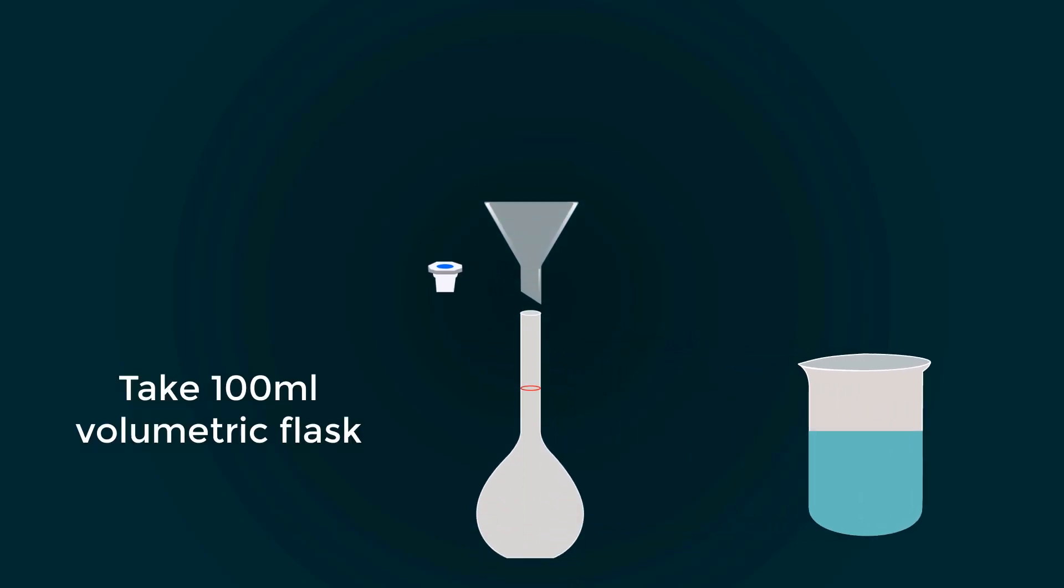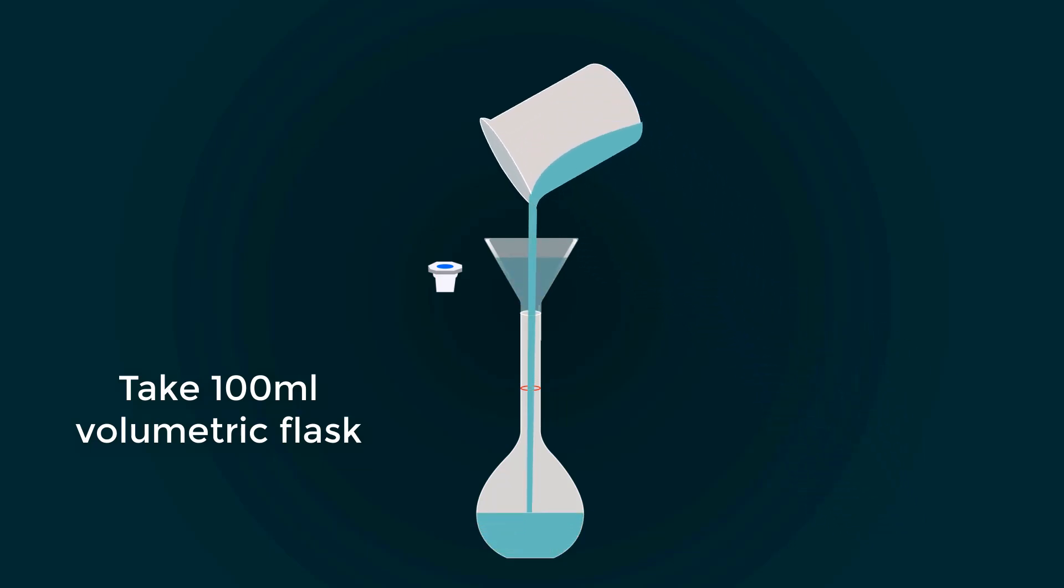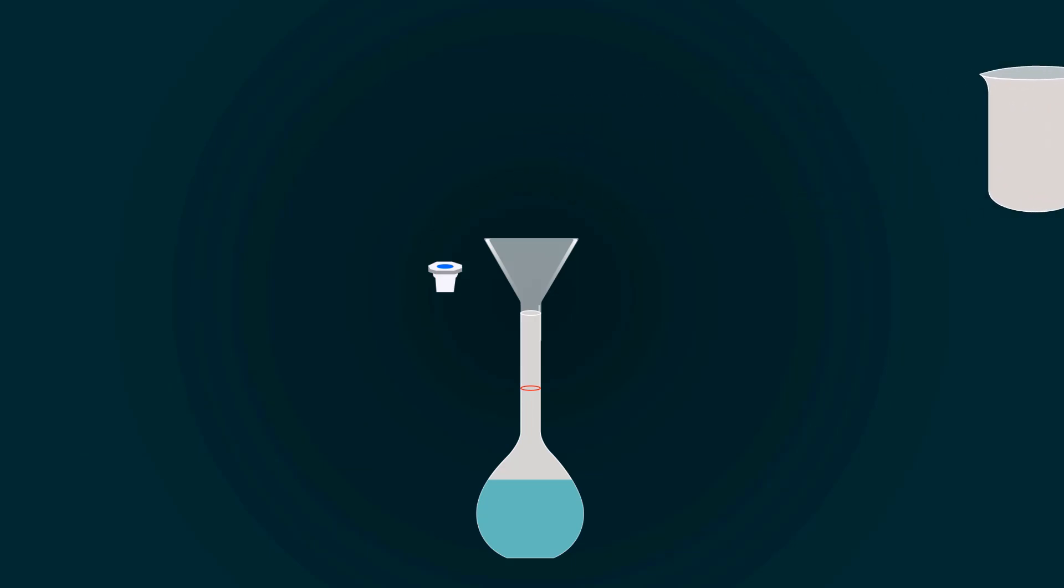Now pour all the solution into the volumetric flask with the help of the funnel. You have to fill the volumetric flask up to the 100 milliliters point. For that, you have to add more distilled water.